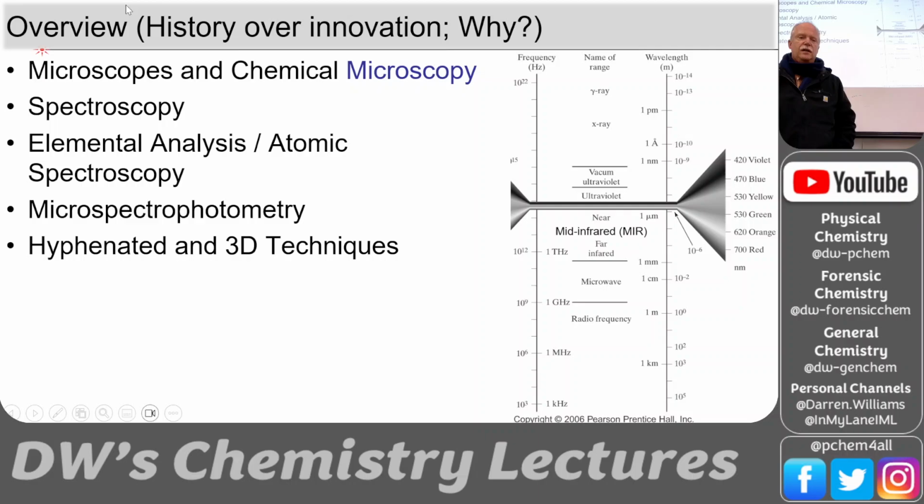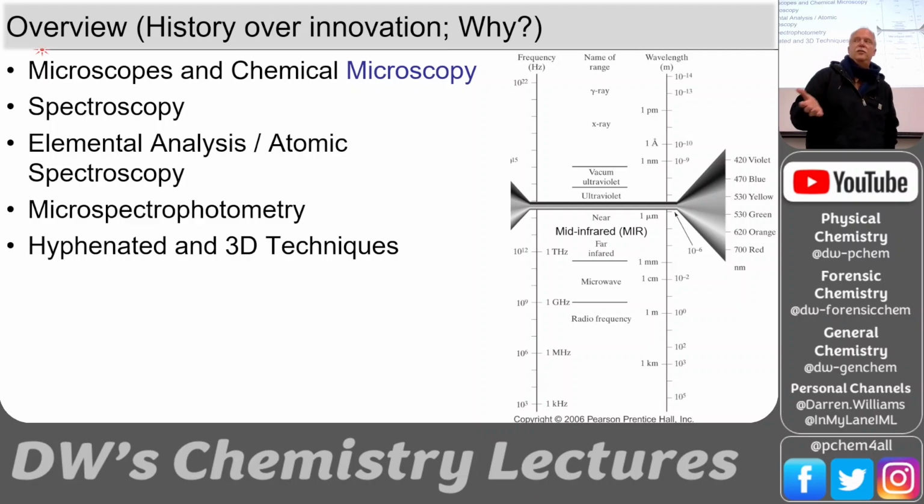And so, again, we want to really look at microscopy. We have modern microscopy like the electron microscopy, but we still use old school microscopy. And that's a historical method that's been used in forensic science. So the question is why? What do you think? Why would we still use something that's ancient and has been replaced with all of these?